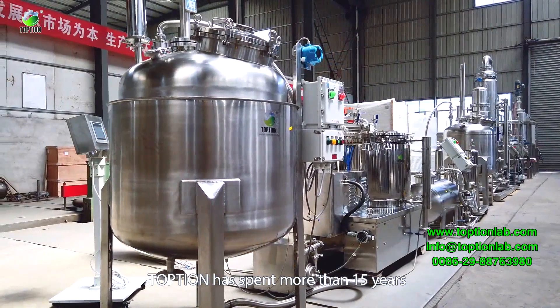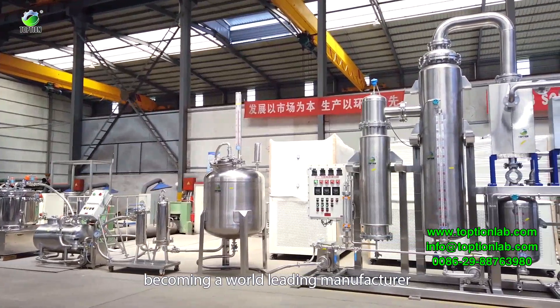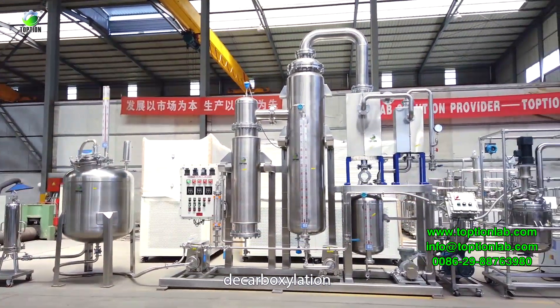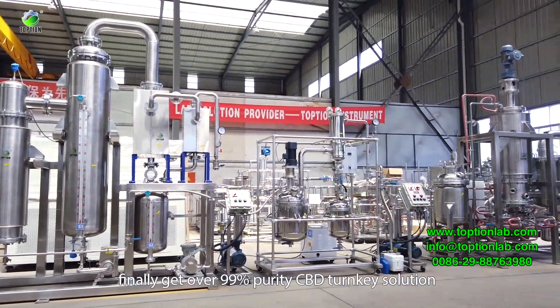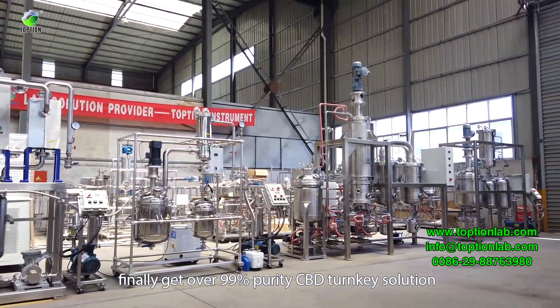Topshun has spent more than 15 years becoming a world-leading manufacturer of hemp extraction, filtration, ethanol recovery, decarboxylation, distillation, and crystallization equipment. Extracting from biomass, the system can finally achieve over 99% purity CBD as a turnkey solution.